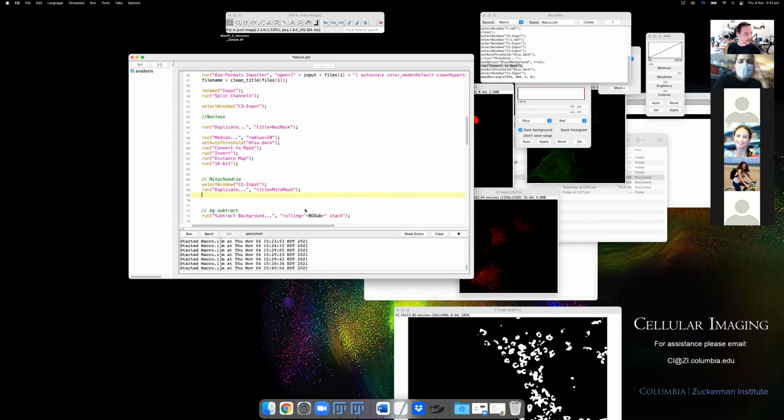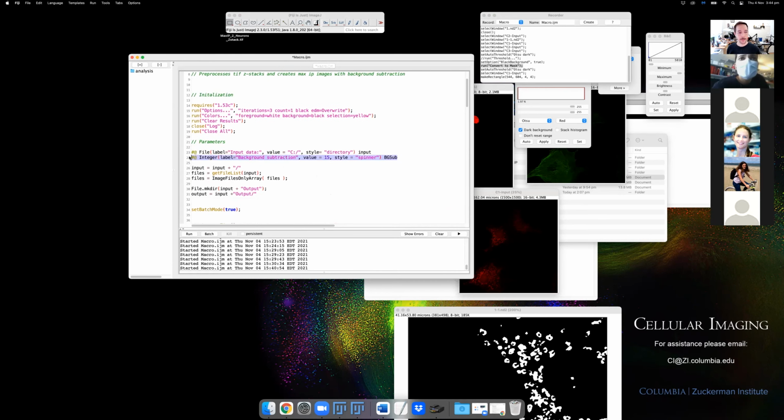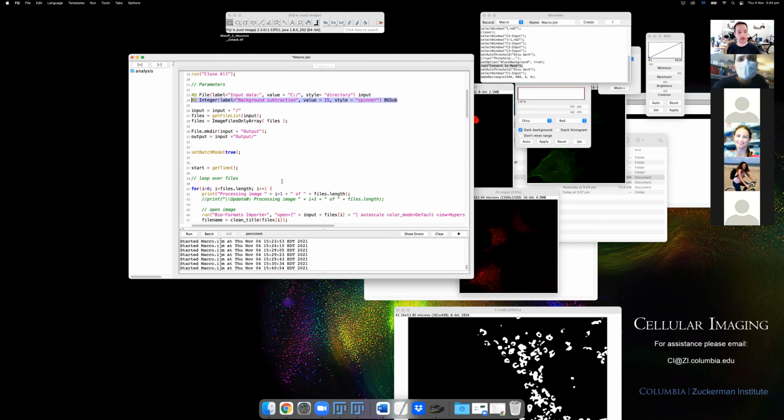We did some filtering. I'm just going to copy and paste these. This was our background subtraction. If we wanted to make sure, we could use the GUI for that, then again, we could just put the background subtraction here. And these are the variables we use for the Unsharp Mask. We won't do it today, but we could put these as variables in the GUI. We could easily just copy and paste this and make some changes to make it easy for someone to do.